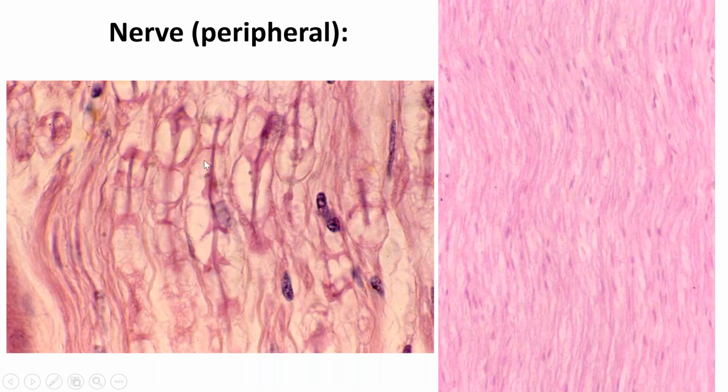This white space out here is the myelin that was washed away in tissue processing, so we have this vacuolated appearance. This pink stuff that you see almost looks like herringbone. Those are called Schmidt-Lanterman clefts. That's basically the cytoplasm that got squished out in the process of myelination. Here's a nice little node of Ranvier, okay? The main thing I want to point out is all of this is lipid and all of this is going to be washed out unless we use osmium tetroxide.